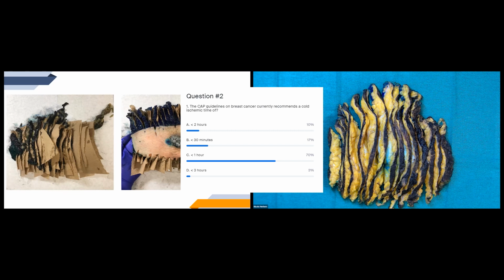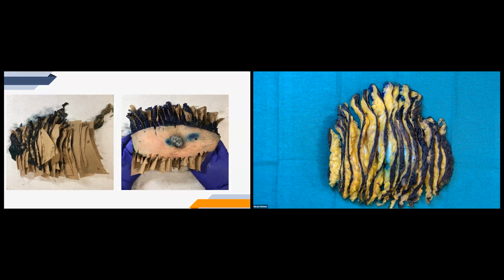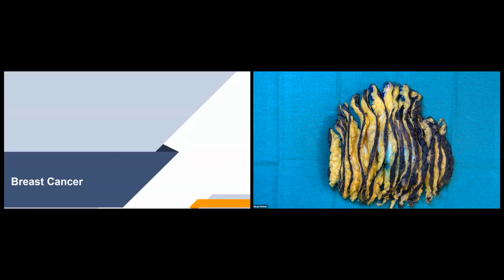It's really important that this is kept under an hour because researchers have found that over an hour has negative effects on immunohistochemistry, which is used to examine breast biomarkers ER, PR, and HER2. As well, accurate results of these biomarkers are very important in patient care as they allow for patients to get targeted treatment. Now we're briefly going to go over some information about breast cancer.